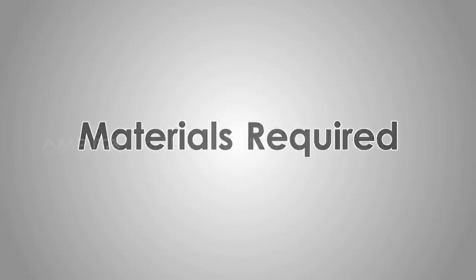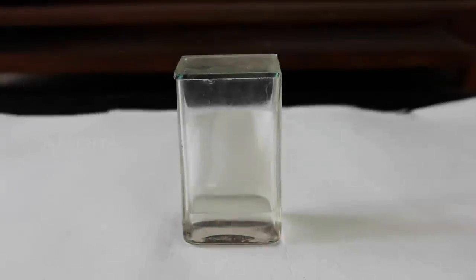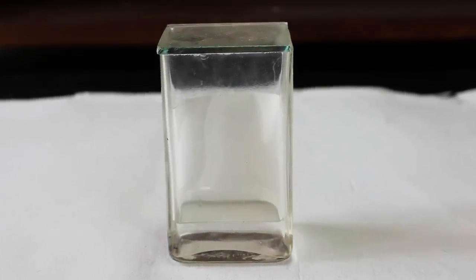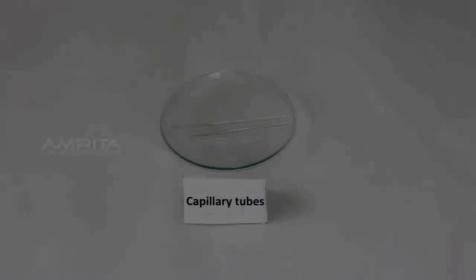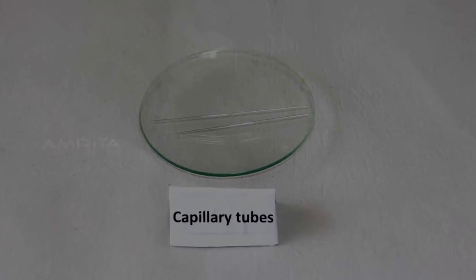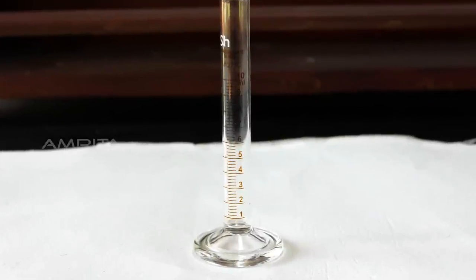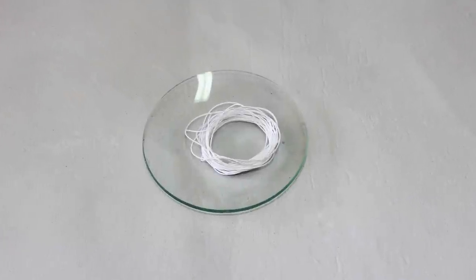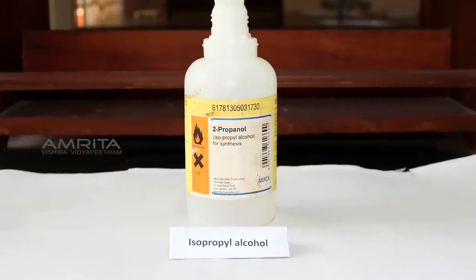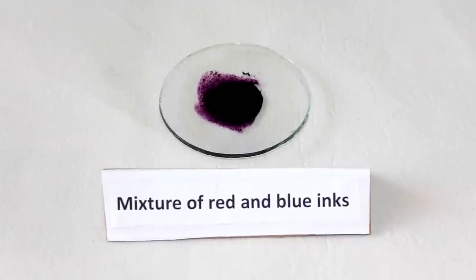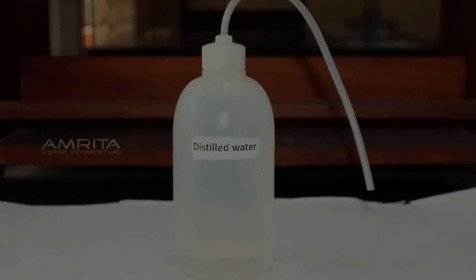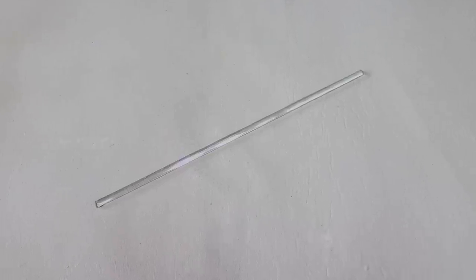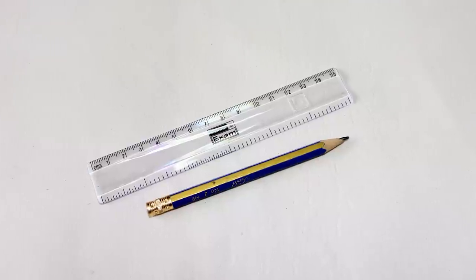Materials required: chromatographic chamber, Whatman filter paper strip, capillary tubes, measuring cylinder, thread, isopropyl alcohol, mixture of red and blue inks, distilled water, glass rod, scale, and pencil.